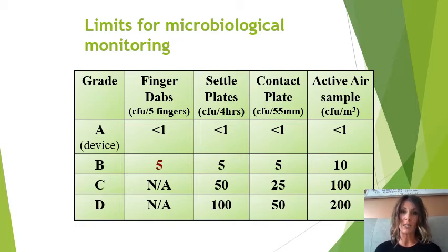Obviously when you originally take your sample, you won't see anything on the plate because microorganisms are too small to be seen by the naked eye. So we assume each colony that has grown up after incubation has formed from one microorganism. However, that is not necessarily the case.